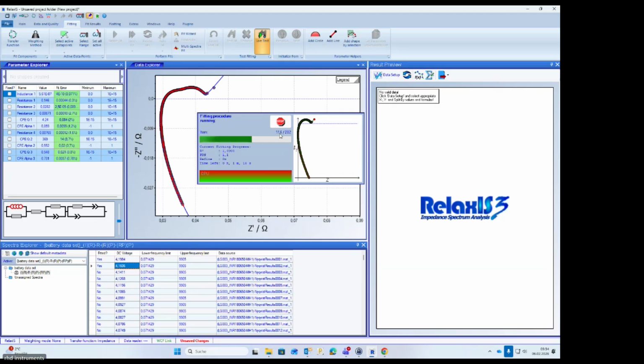Okay, so only a few. It's okay, only 1 minute left. Maybe the next time I use, instead of 200, only 100 spectra, but yeah, we are almost there.